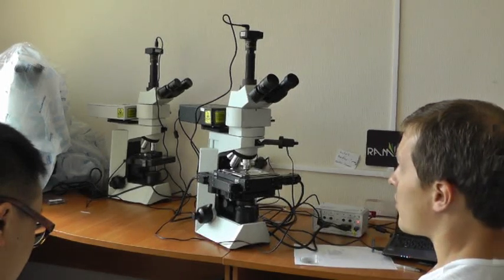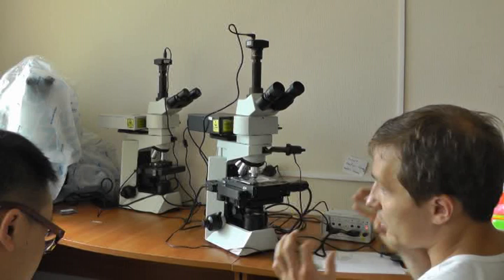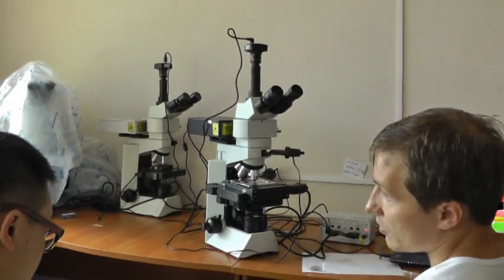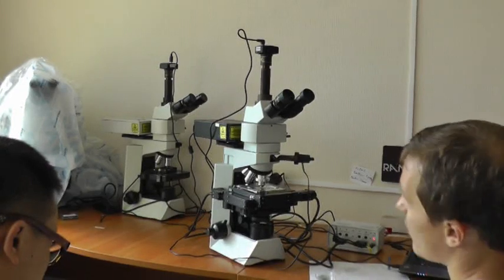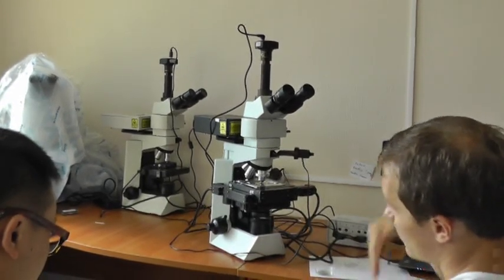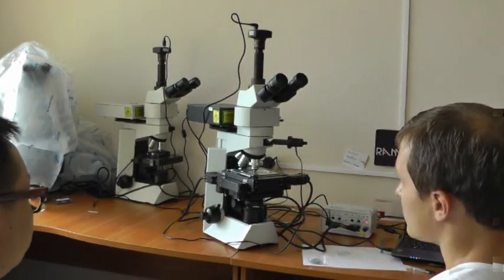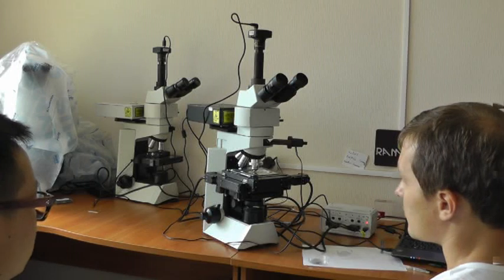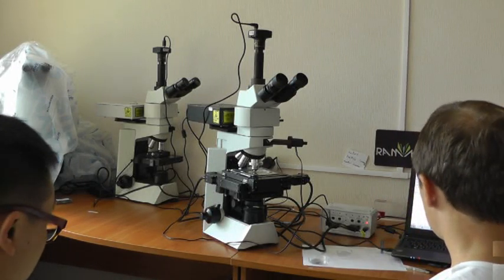As I understand, any modern microscope has a binocular along with a trinocular to connect a video camera, for example, and it will enable us to build our system in.